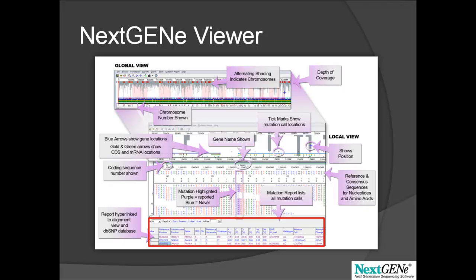The mutation report can be seen at the bottom here, although it can also be hidden or displayed on the side.